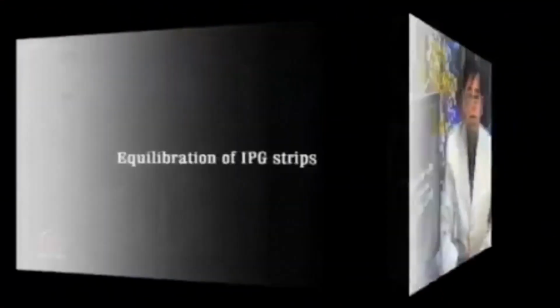The DTT reductant will be used for the first step, followed by IAA, iodoacetamide, which functions as a scavenger of the excess reductant and alkylates and prevents the reoxidation. So, here you can see how different bonds are broken from the disulfide, and IAA is preventing the reoxidation, alkylating these residues.